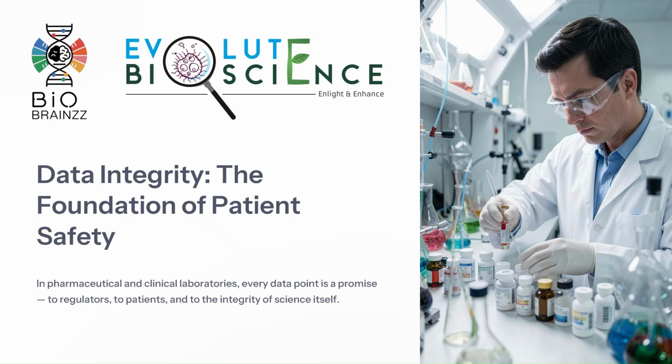In this session, we are going to discuss a very important topic in pharmaceutical and clinical laboratories: data integrity, the foundation of patient safety. Every test result, observation, calculation, and report generation in a laboratory directly impacts decisions regarding product quality and patient health.